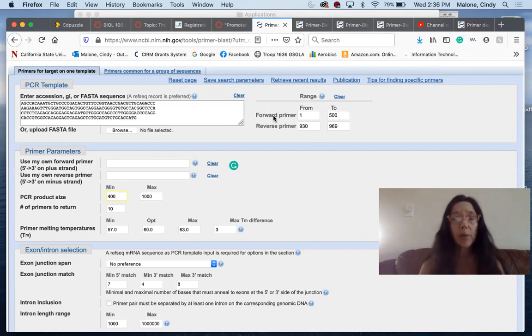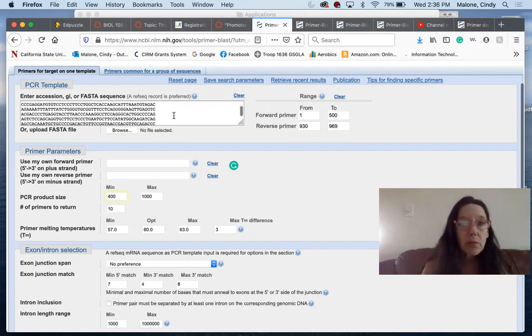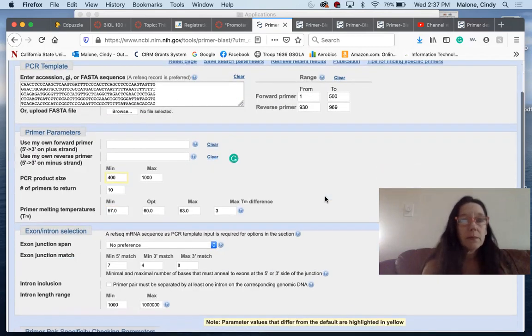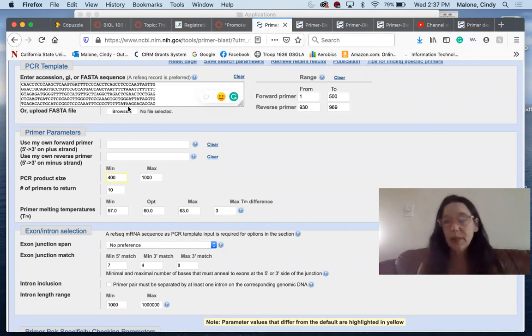And then the forward primer, the one right up on the top of our sequence, which I can scroll, that we can have way up here. We only need about 500 base pairs. Ideally we'd get more, 800 or 900, but if we have to, we could just get the 500.